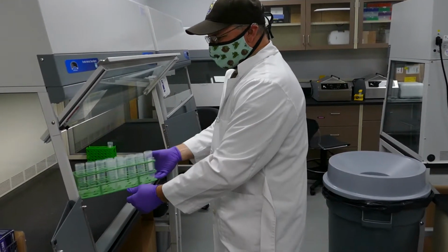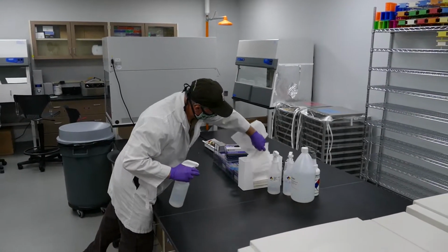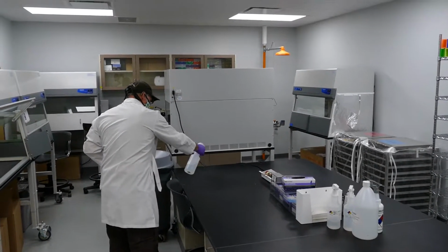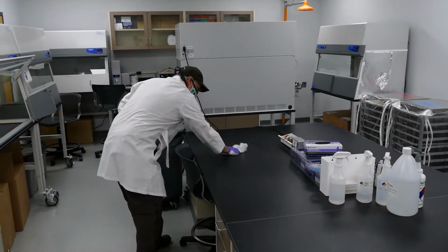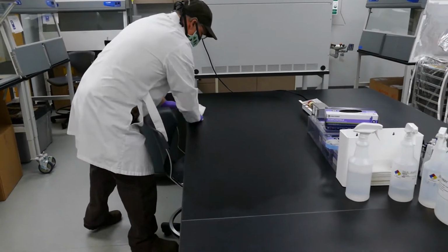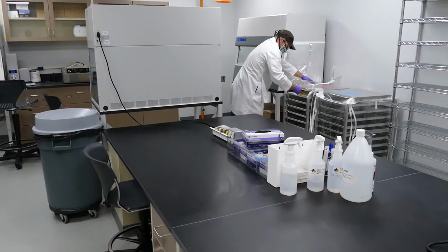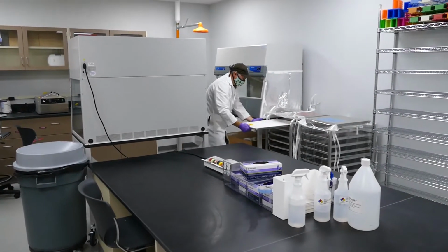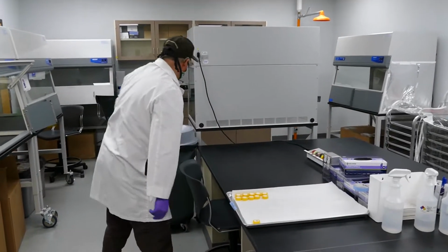Once the tubes are dried, always assume there was a possibility for contamination, so clean your workbench again with DNA Away and clean paper towels. Retrieve the tray with the corresponding caps and place them on the workbench. Then place the tubes in the hood control alongside it.